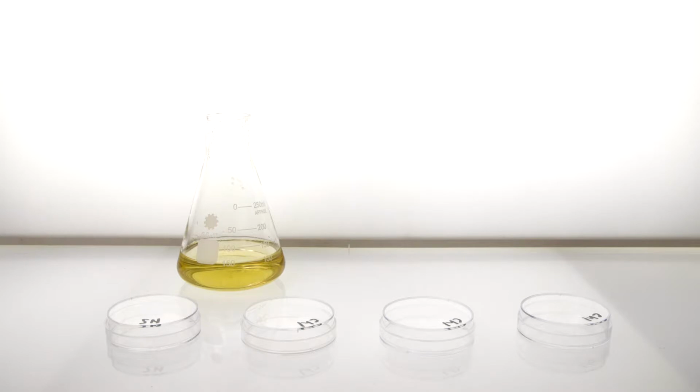Once everything is dissolved, it's time for you to pour your non-selective plates. Later, you'll add chloramphenicol antibiotics to the agar. Remember, non-selective plates equals no antibiotics, and selective plates equal antibiotics. More specifically, chloramphenicol. Pour the agar into the dishes as gently as possible.